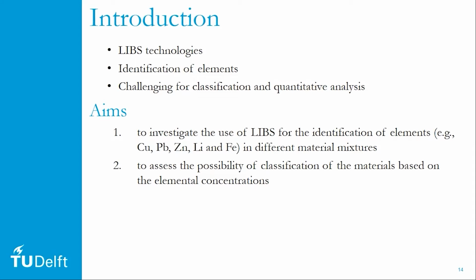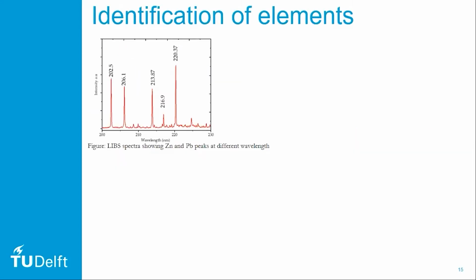For this study, the LIBS data were collected using the IRIS spectrometer at Spectral Industries Laboratory. After the LIBS data were collected, data pre-processing techniques were applied to minimize the noise in the spectral data.